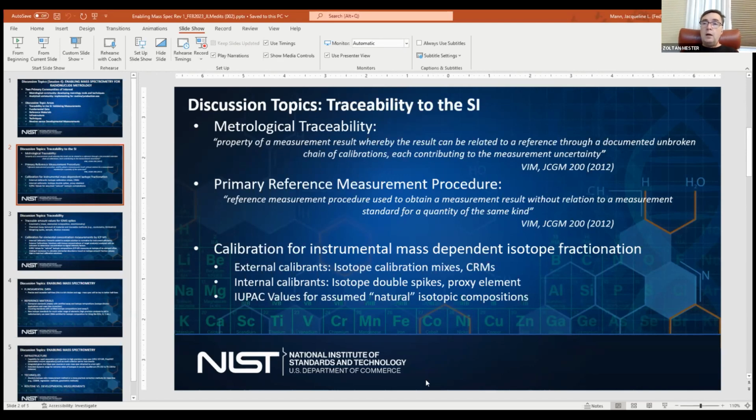However, there are mass spectrometry approaches for both isotopes and mole or mass fractions which are primary. You can do direct measurements with very large uncertainties, which require no external calibration input.